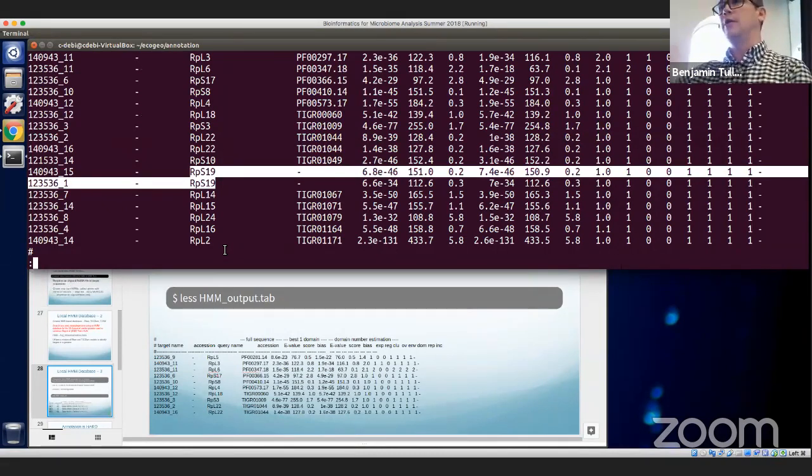At this point, and this is what we're going to do in the next session with the phylogenetic side of it, we could take all of these markers and start building them into a larger phylogenetic tree on a big tree of life, right? And get an accurate idea of what type of cyanobacteria we're looking at.